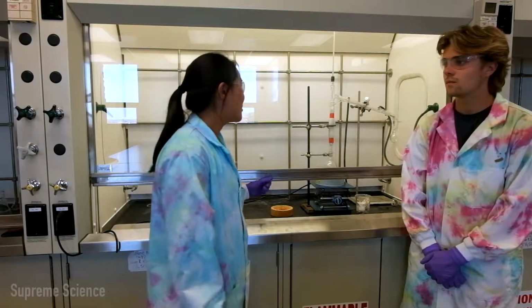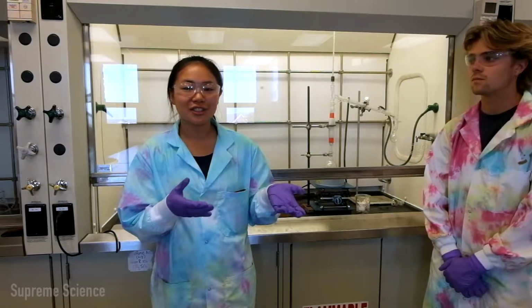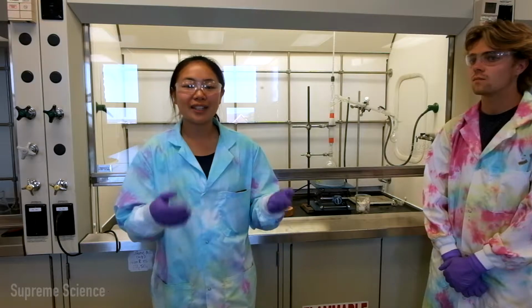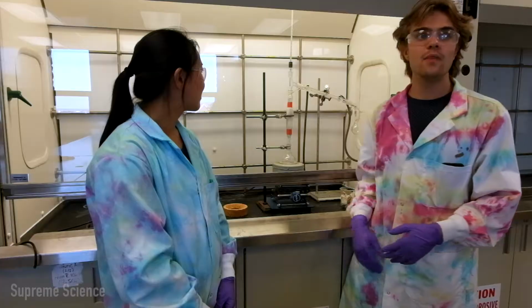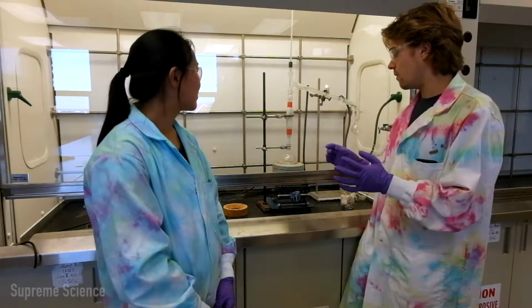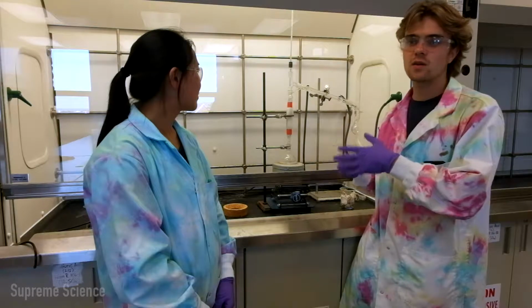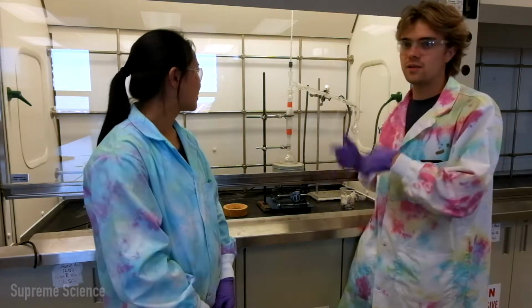In order to increase efficiency, you can see in our column we have glass beads. The surface of each glass bead acts kind of as a mini distillation setup, so you have many distillations happening at once, and this increases the efficiency. This process continues: condensation occurs, new vapor mixes with the condensation to create a new vapor mixture, and then it evaporates further up the column.